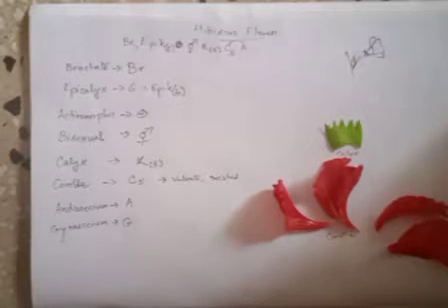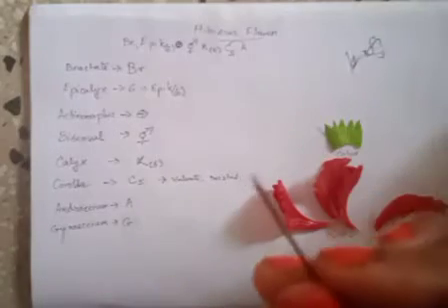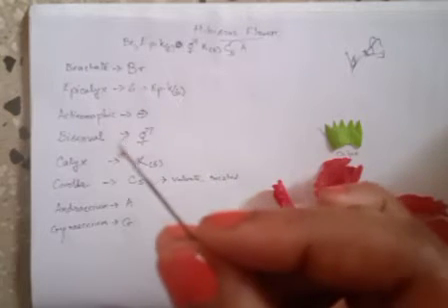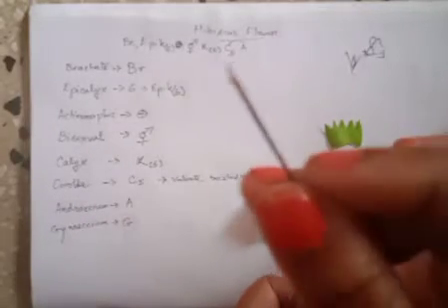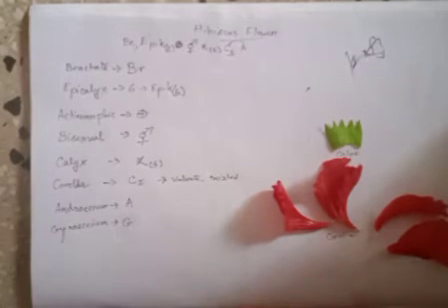So you see, these are the anthers that I've just collected now. This is the anther. So just see here. I hope you are able to see the anther. So here you have the anther. Okay. So in the anther you can see. I'll place it over here. Fine. Next, I'm just trying to remove out the stigma, by having a small incision.